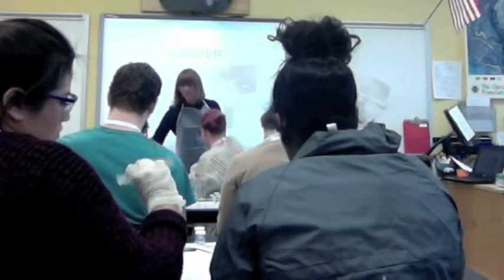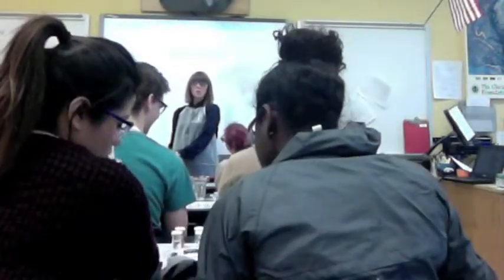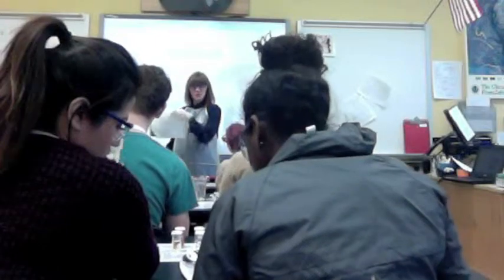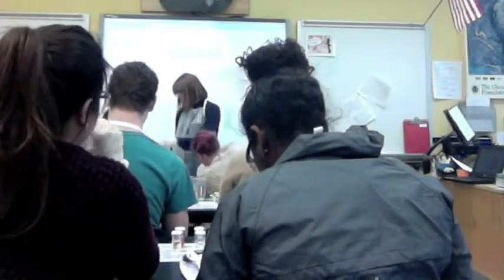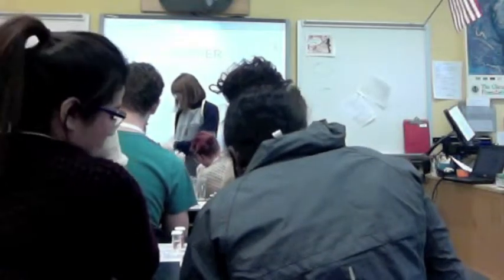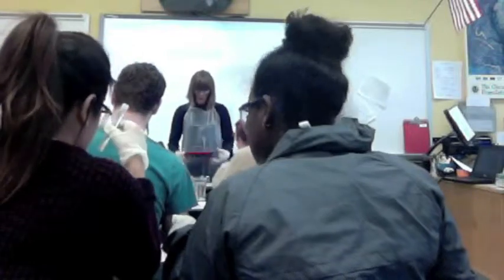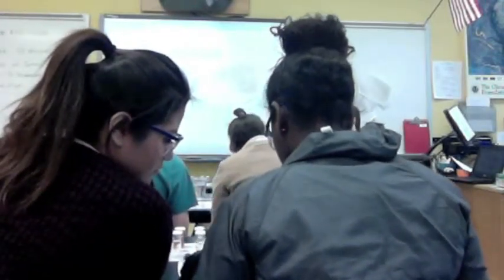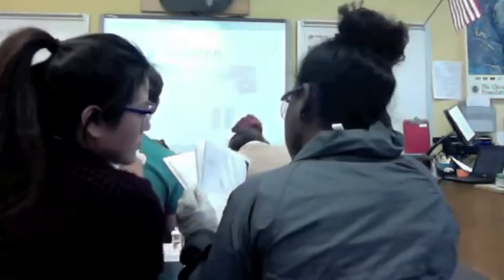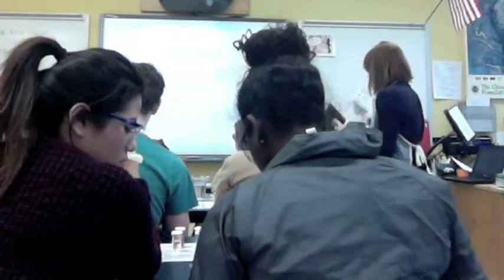Okay. Thank you, Ms. Griffin, for writing your answers down in your packet. This packet is important for me to know whether or not you are achieving mastery of this learning objective. So it is important that you start writing and filling in your table. Your table will be found on page 12. All right. So orange is fine, blue is copper. All right, we're moving on to nitrates.